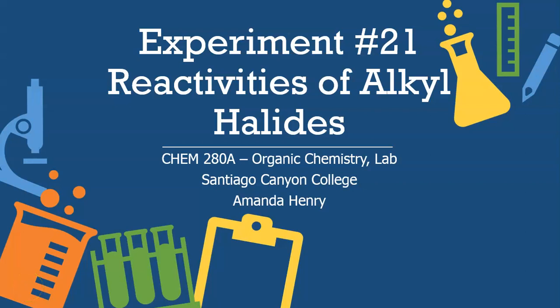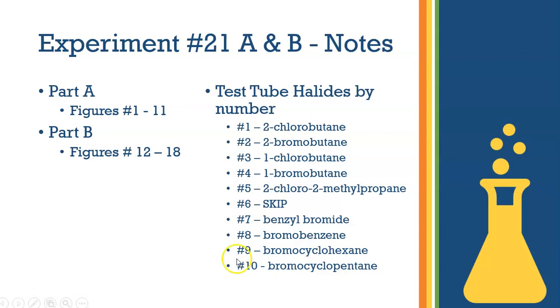This video is going to cover experiment number 21, reactivities of alkyl halides. The procedure and the data will be shown. We are going to cover parts A and B. Part A will be the first 11 figures and part B will be the remainder.